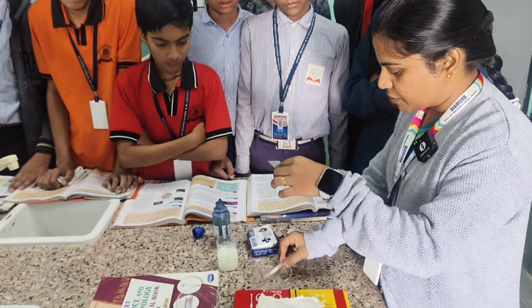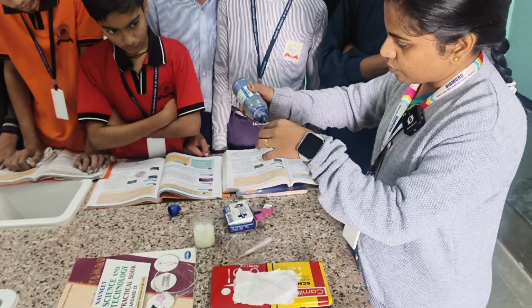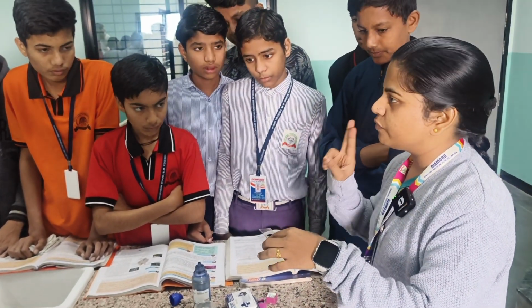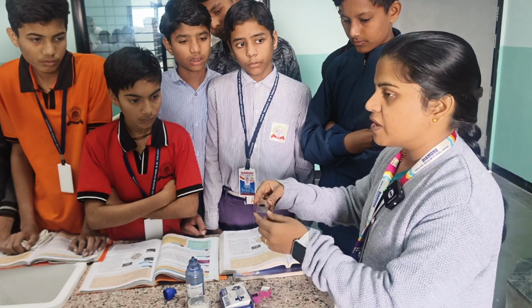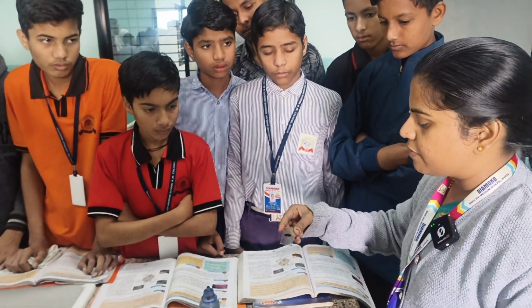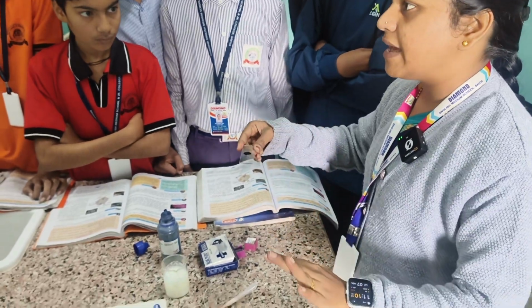After this, we put a drop of methylene blue. After putting the methylene blue, we have to wait for 2 minutes. After 2 minutes, we have to remove the extra material, that is curd and methylene blue, and wash the slide, but we have to wash it properly, otherwise our smear will get damaged.